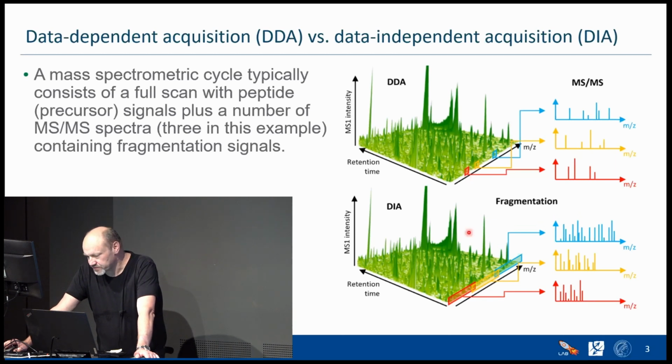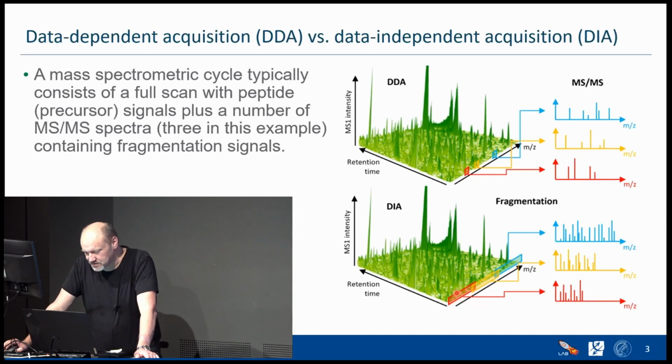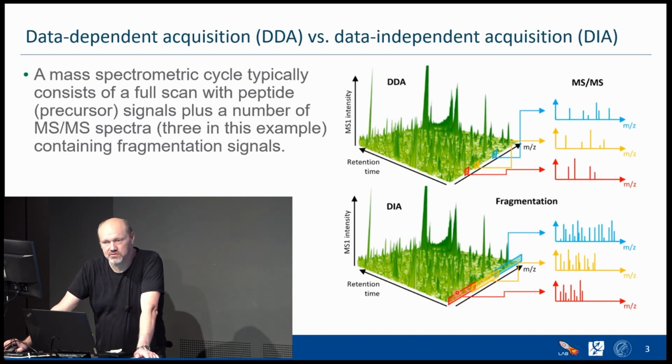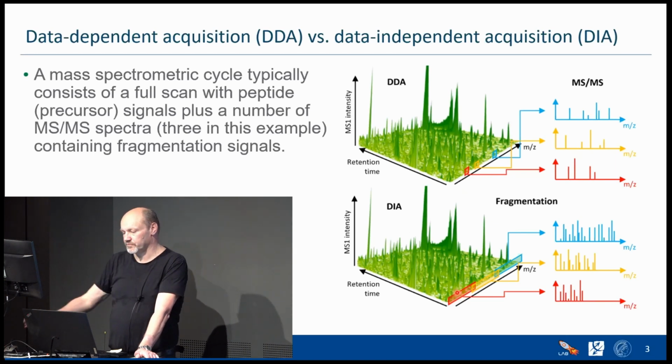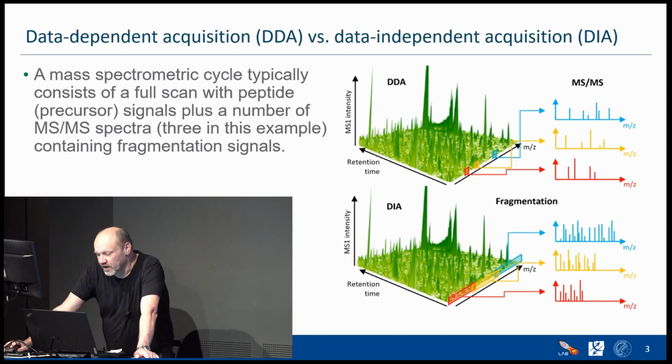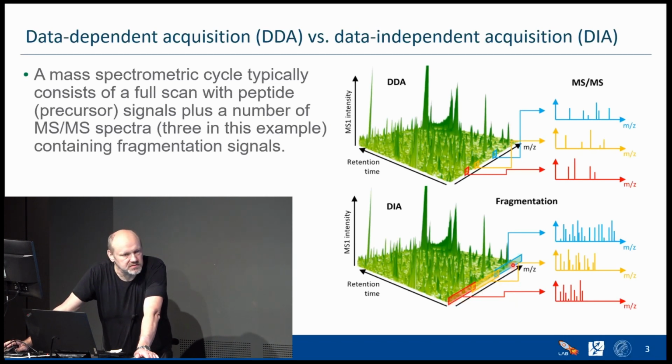And that's actually very different in DIA. So down here, you see that these windows can be large. I mean, they can also be small, but the idea is that they are, first of all, fixed, so they don't change their position over the measurement, and that they cover some range completely, like let's say from 400 to 1000 m/z or something like this. So you want to cover the whole range, so you have to put windows in there to cover it completely.